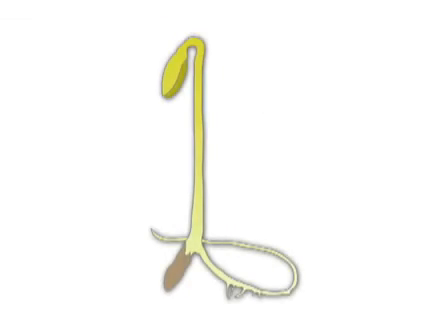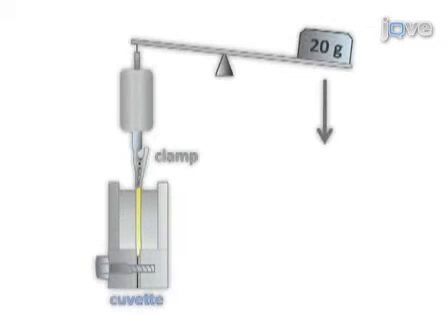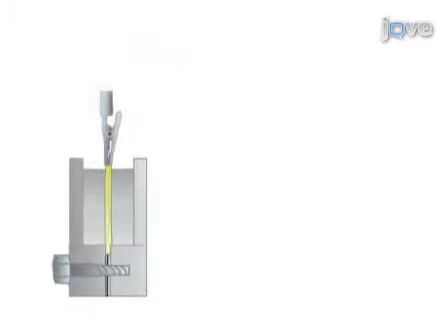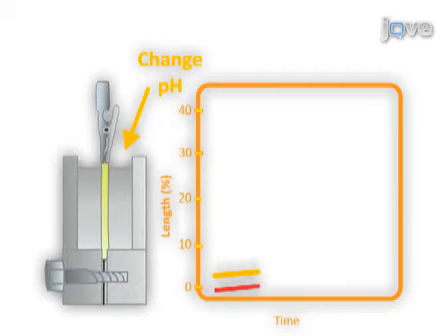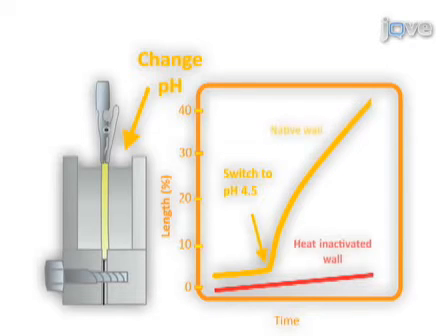Here we demonstrate methods for measuring expansin activity by cell wall extensometry. Suitable wall specimens can be prepared from the hypocotyls of etiolated cucumber seedlings. To measure acid-induced extension, which is catalyzed by endogenous expansins bound to native cell walls, we clamp the walls at neutral buffer and an extensometer. Upon switch to acidic pH, expansins are activated and the cell walls extend rapidly.